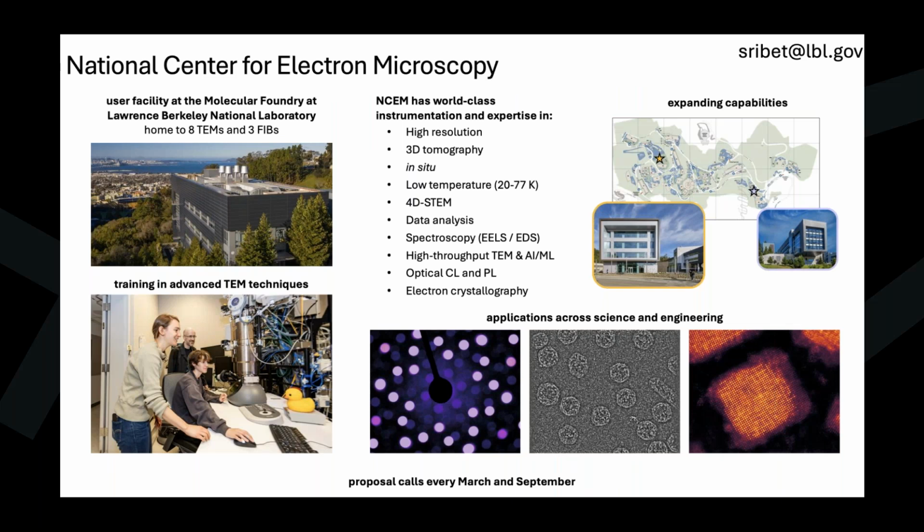And we do research in a lot of different areas, spanning different applications of science and engineering, especially focused on material science. What's exciting for me is we're actually expanding. So we'll have some new instruments going in a new building, and this is very focused on new tools for cryo-electron microscopy. It is free to use our center because we are a user proposal center.